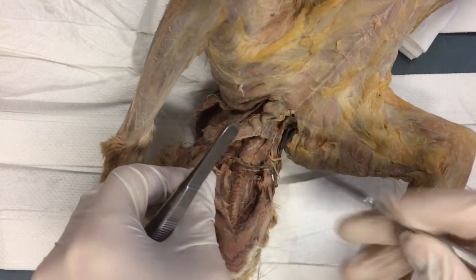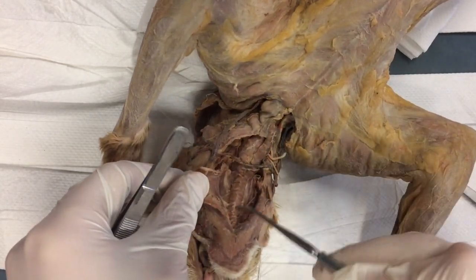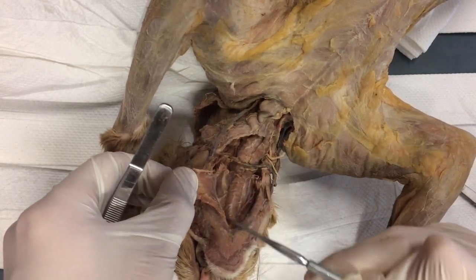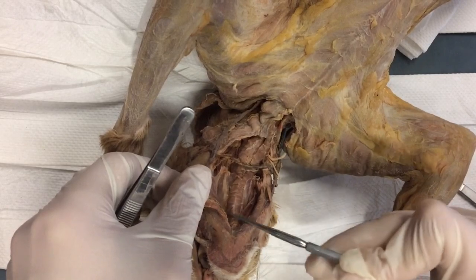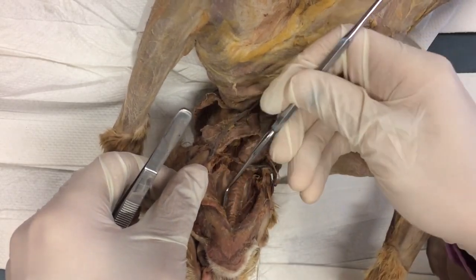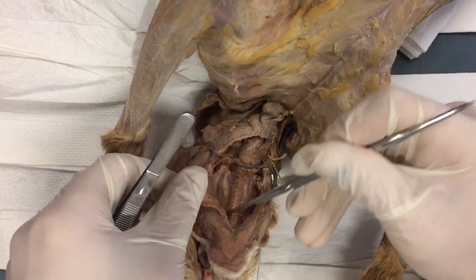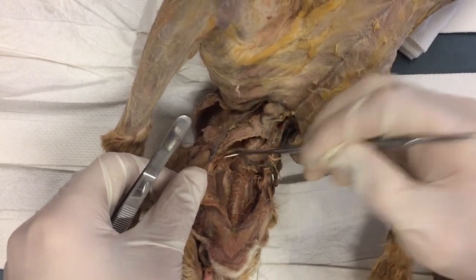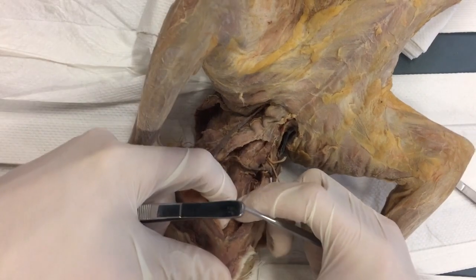So now I'm going to hold this with my hand. You should be able to see the connective tissue underneath. Get my hand out of the way. And I'm just going to gently, using the round side of my probe, just going to break down some of that connective tissue and just back this up. And then I should be able to take my forefinger.